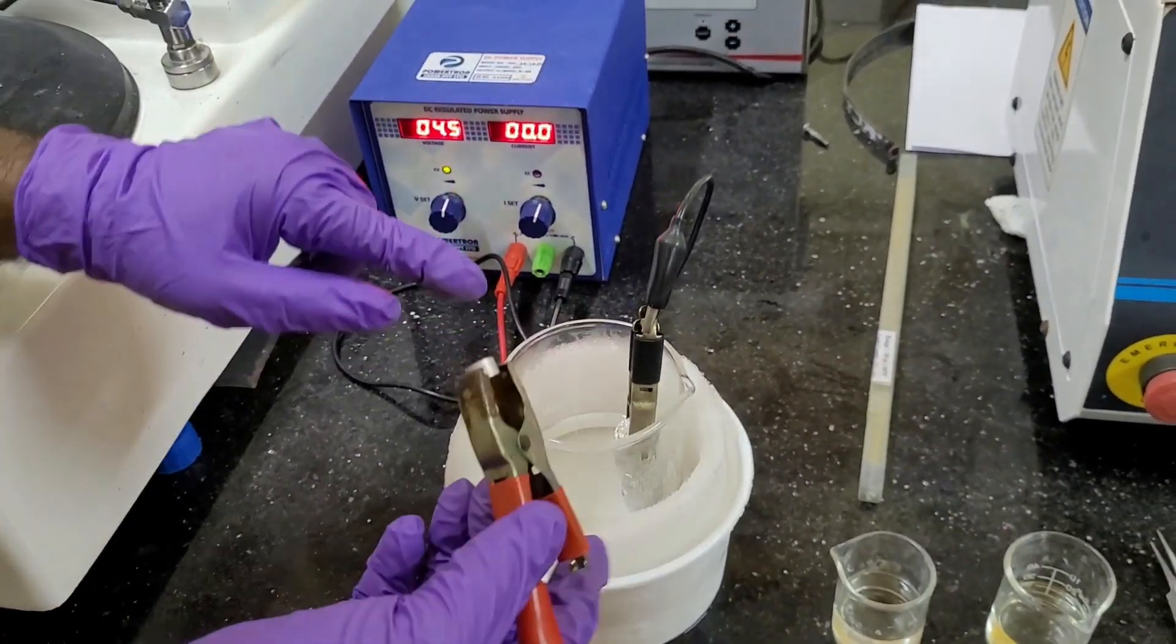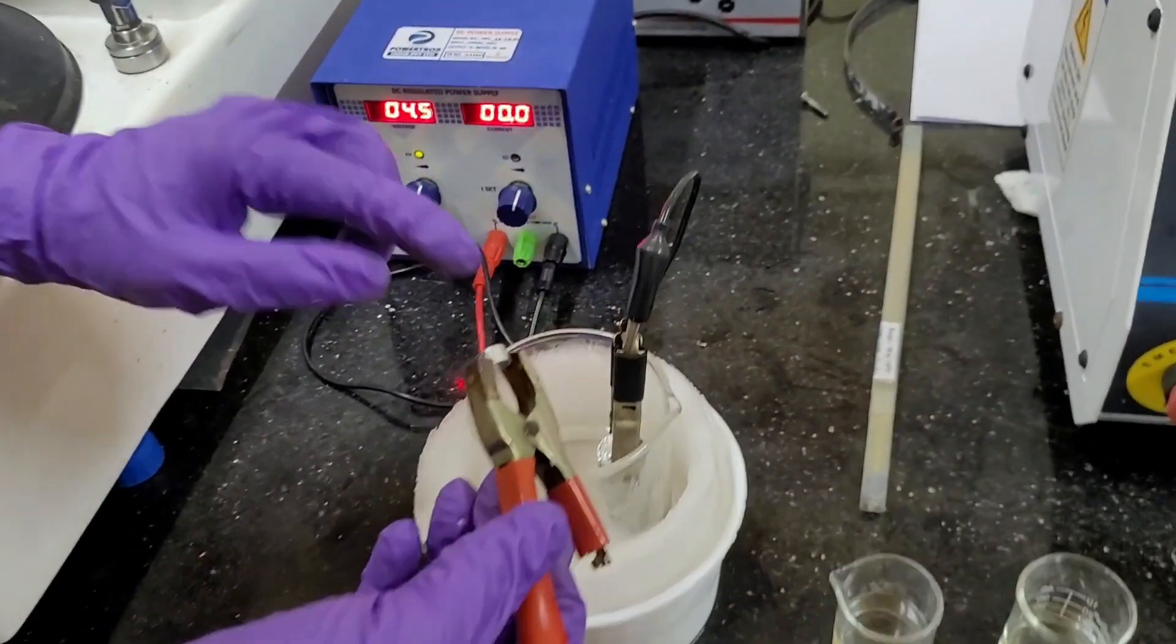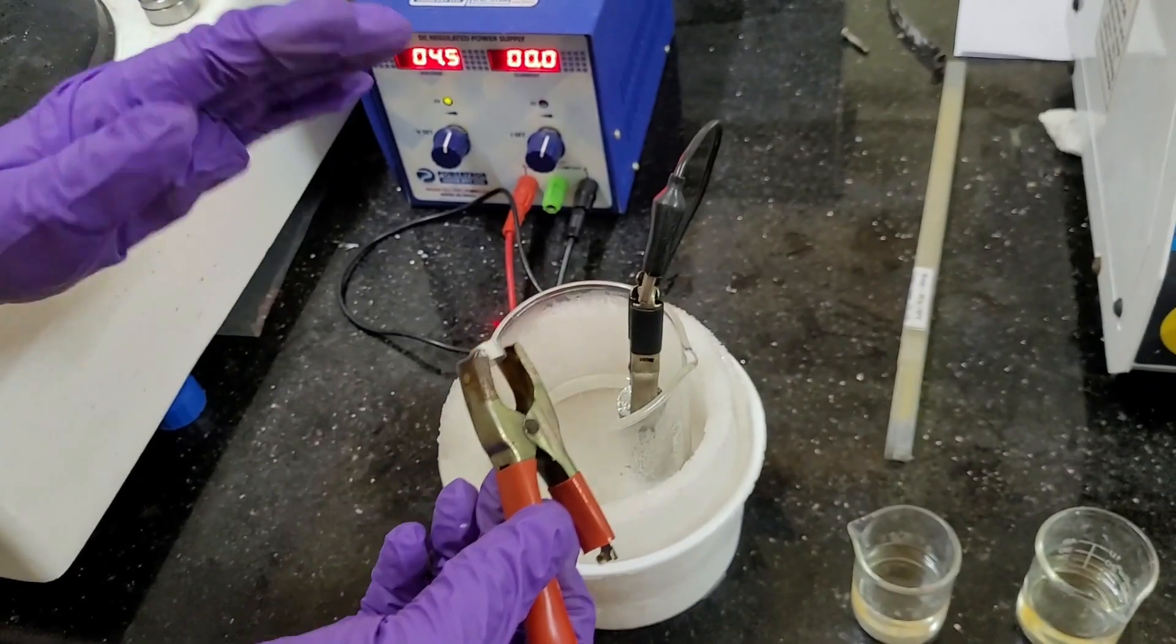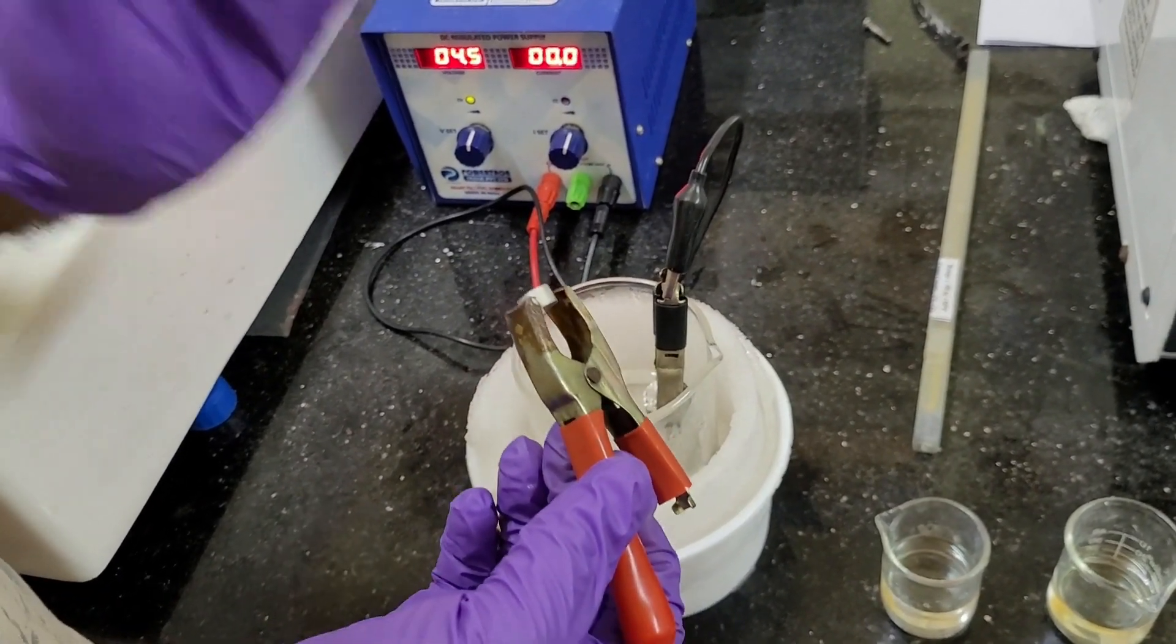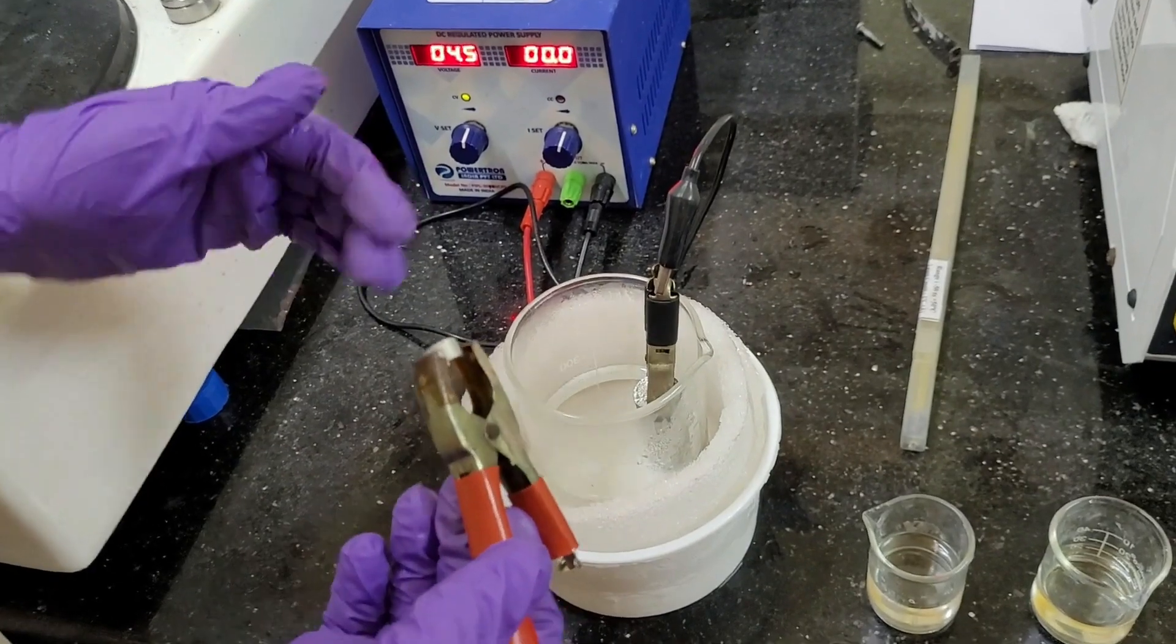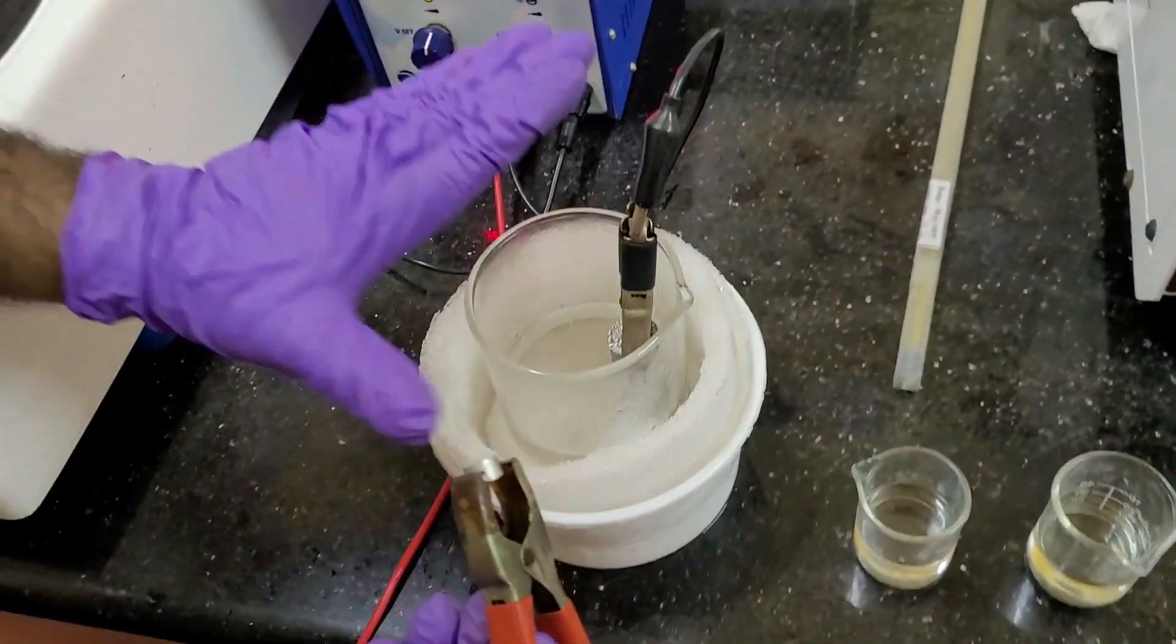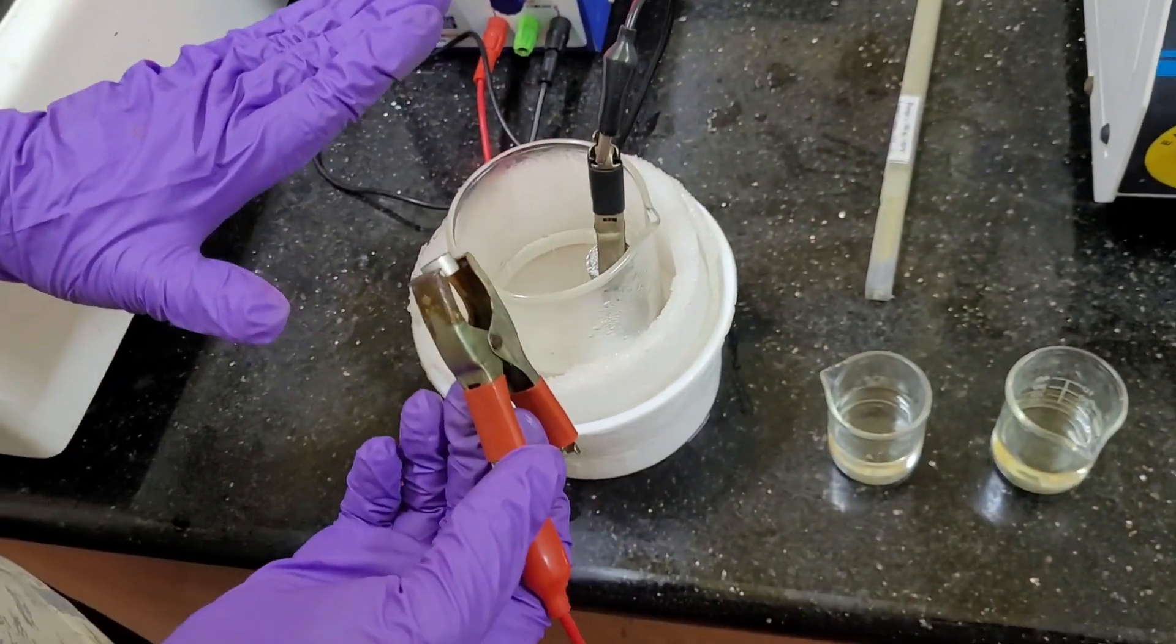We are going to use, when we start the electropolishing, we are going to measure the time. So, our time is, optimized time is near about 5 to 6 seconds. And now, we are going to start. And the temperature maintained is minus 20 degrees centigrade approximately.